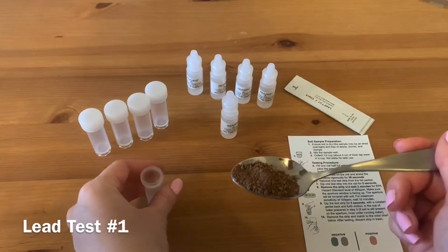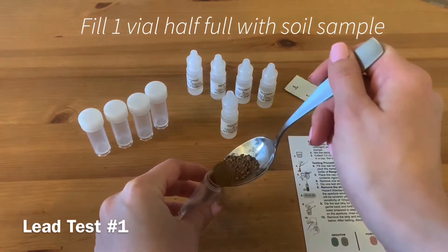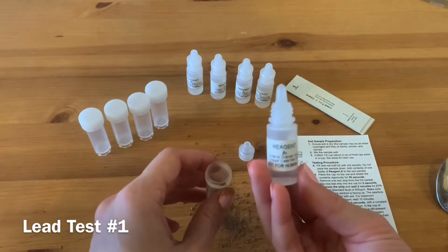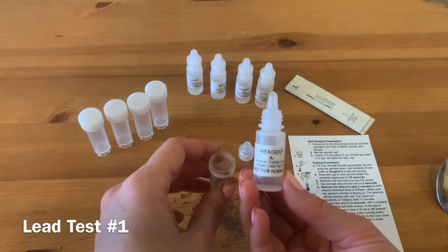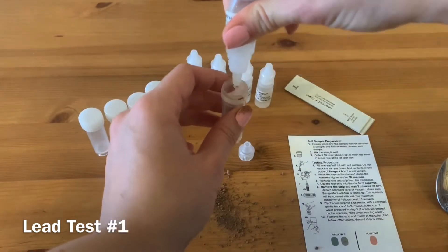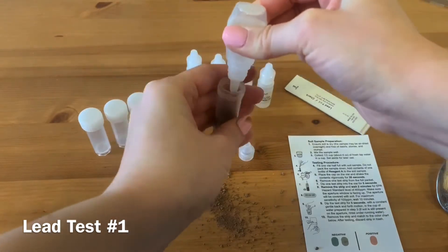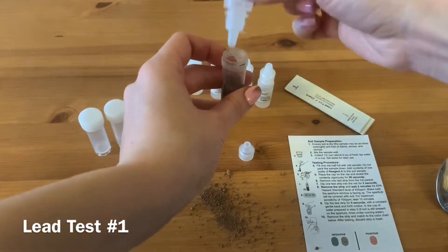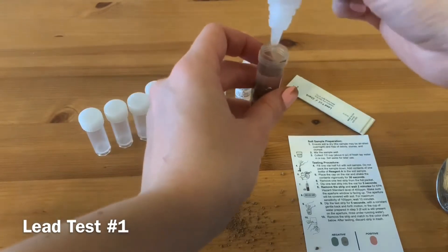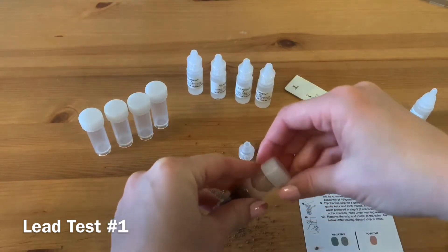Fill one vial half full with a soil sample that is well mixed and air dried. Add the contents of one bottle of reagent A to the soil sample. Place the cap on the vial and shake the contents vigorously for 30 seconds.